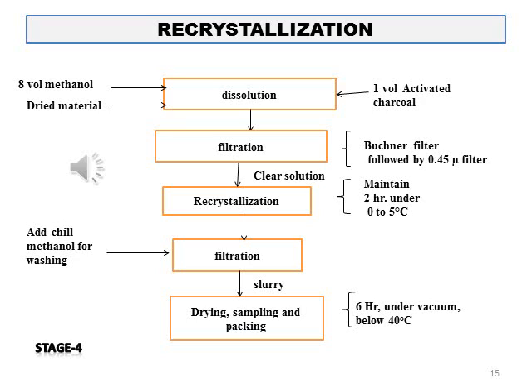We got some material falling out in the RFA. It is called a crystalline material, formed from the solution. After the maintenance period, we did filtration.